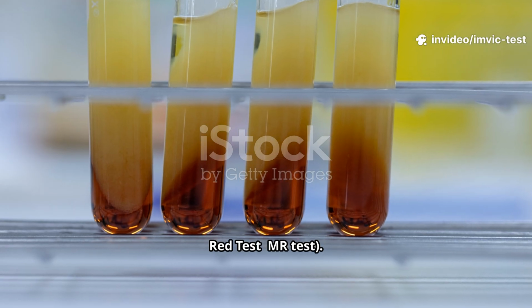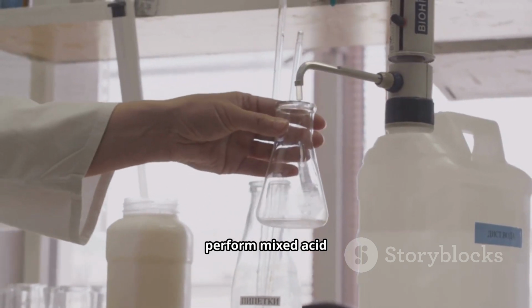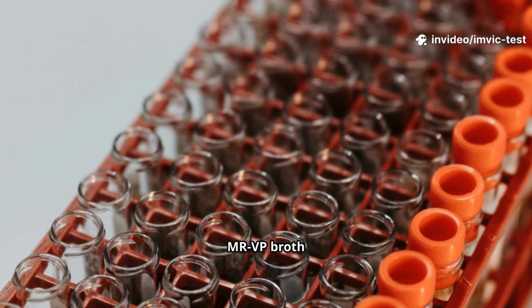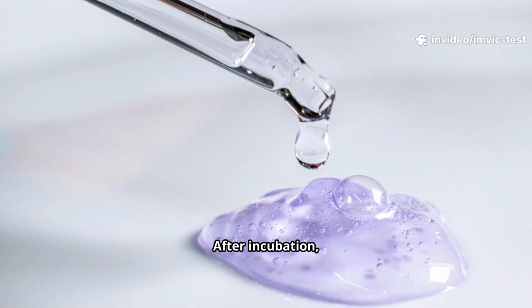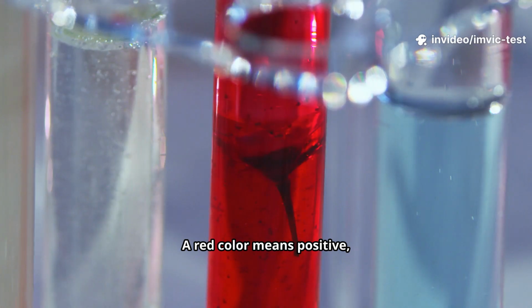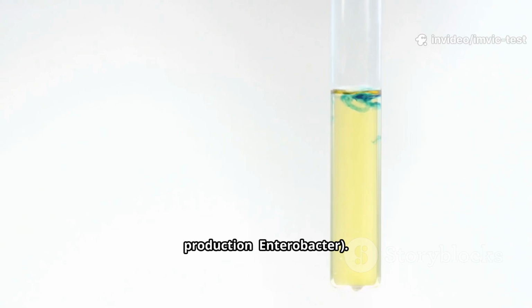Next is the Methyl Red test. This test checks whether the bacteria perform mixed acid fermentation of glucose. The medium used is MRVP broth containing glucose. After incubation, we add a few drops of Methyl Red indicator. A red color means positive, showing strong acid production, as in E. coli. A yellow color means negative, indicating less stable acid production, as in Enterobacter.